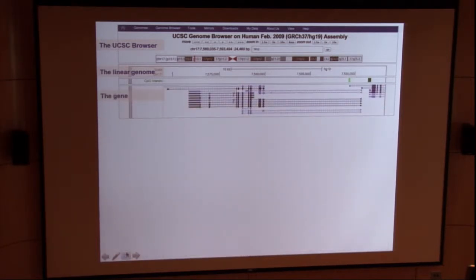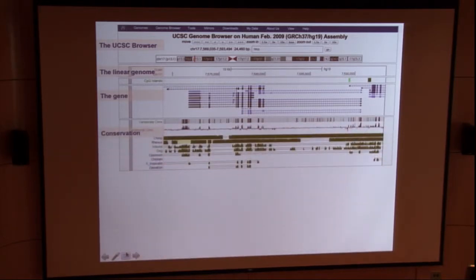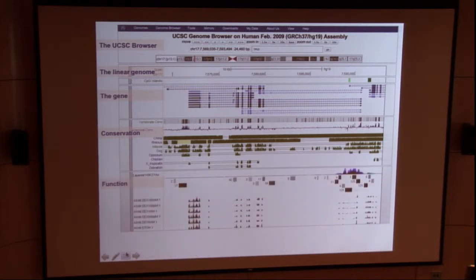So we can just lay them out and then start aligning stuff to it, right? So you can get the genome in a linear shape. You can put annotations, that CpG island here, gene structures, right? You can have genes aligned to this linear genome, and then you can start aligning lots of other things, conservation. So it's a necessary simplification of the genome, but that allowed us to add all sorts of information to the genomic sequences.